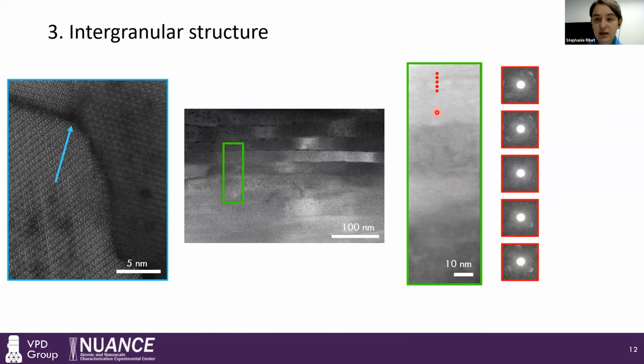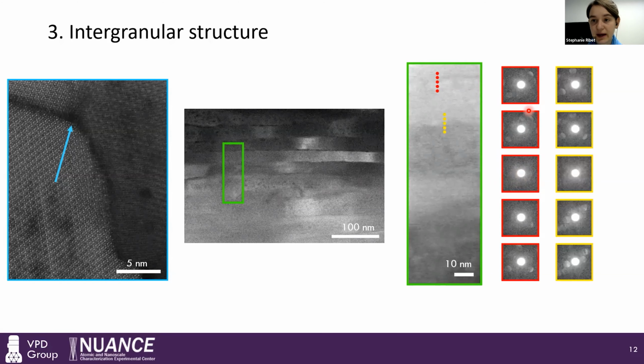along between grains. So as we cross a grain boundary right here, you can see these are strong Bragg spots that are from this orientation of the crystal. And down here as well, you see Bragg spots at a different crystal. In between, you lose the strong Bragg intensity and you see a little bit more brightness towards the central beam. So this is telling us that we're losing our strong crystalline order. So we have some disorder or some amorphous region going on there. We can do the same thing at the next crystalline domain, and we see the same effect where at the central spot, you are losing your strong Bragg disks. This tells us a little bit about the disorder that we see at the intergranular region in the enamel.